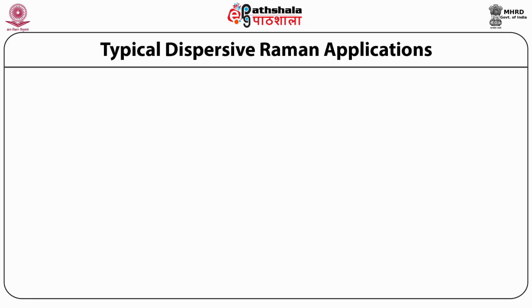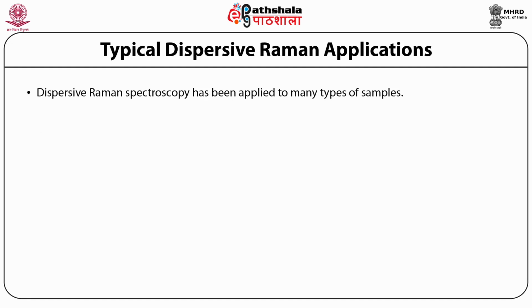Typical Dispersive Raman applications. Dispersive Raman spectroscopy has been applied to many types of samples.